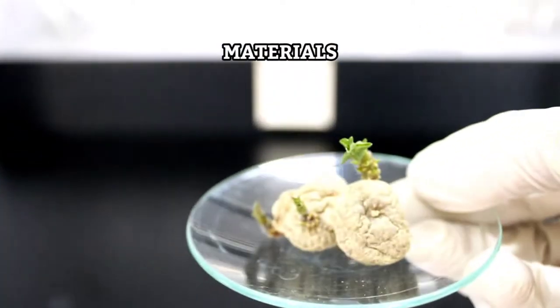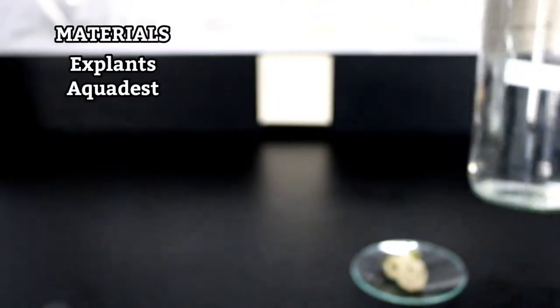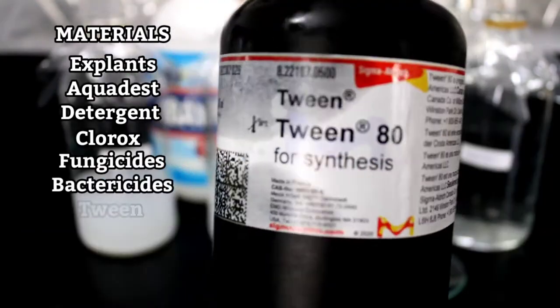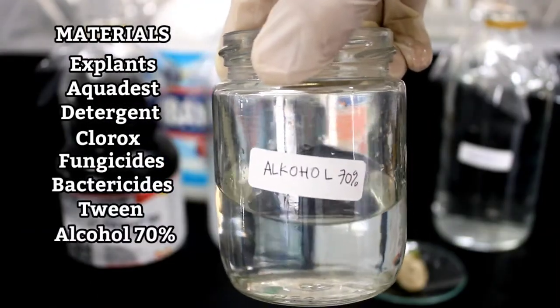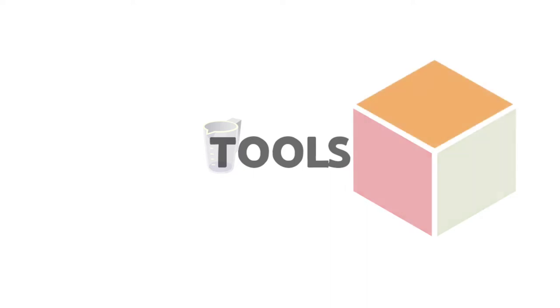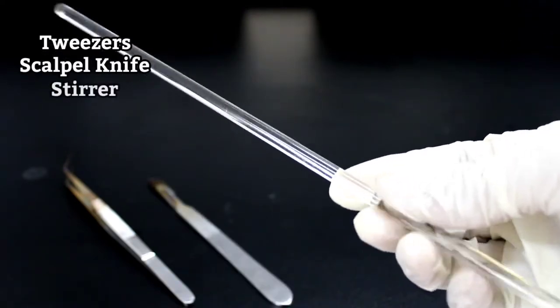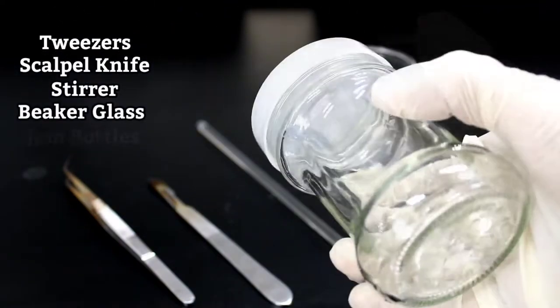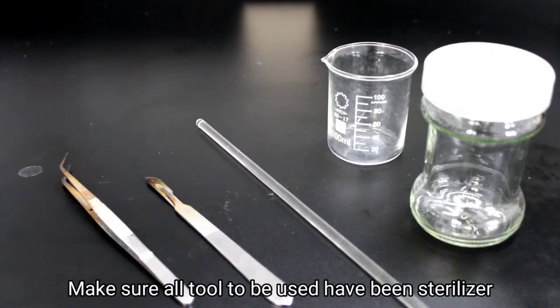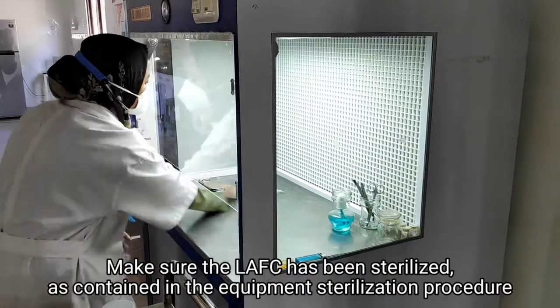Materials and Tools. Procedures: Make sure all tools to be used have been sterilized. Make sure the LAFC has been sterilized, as contained in the equipment sterilization procedure.